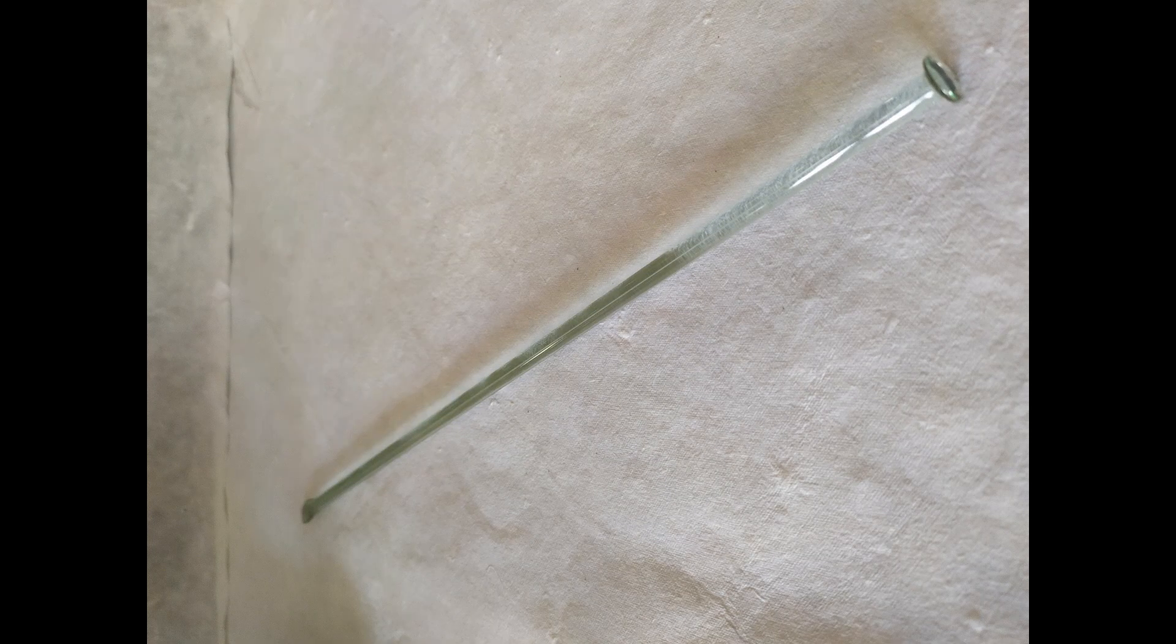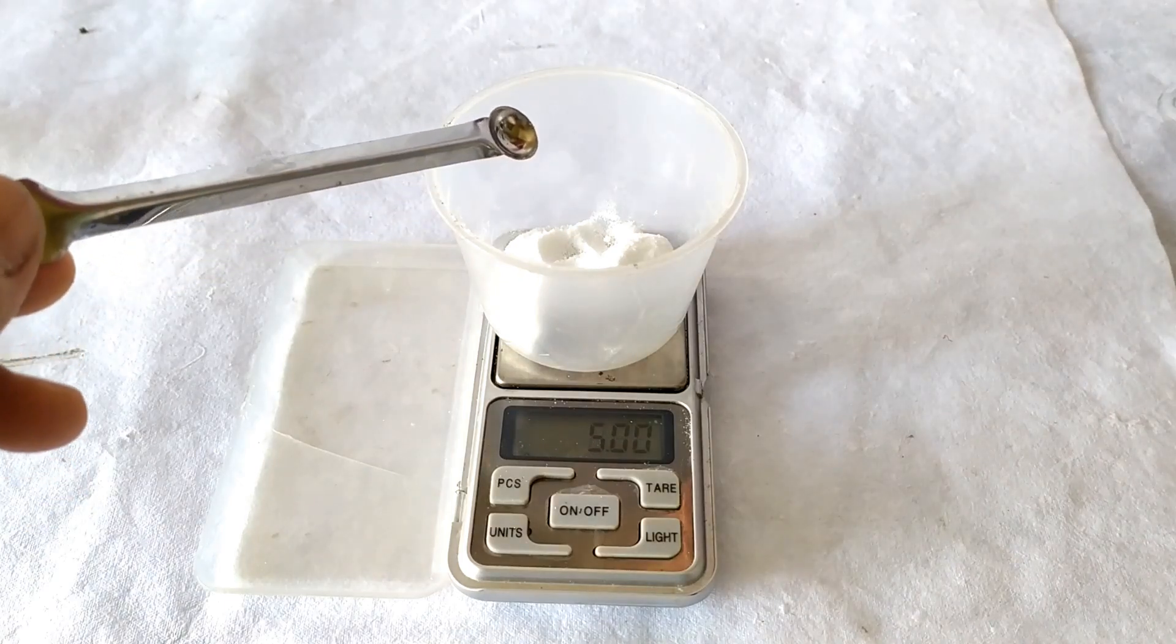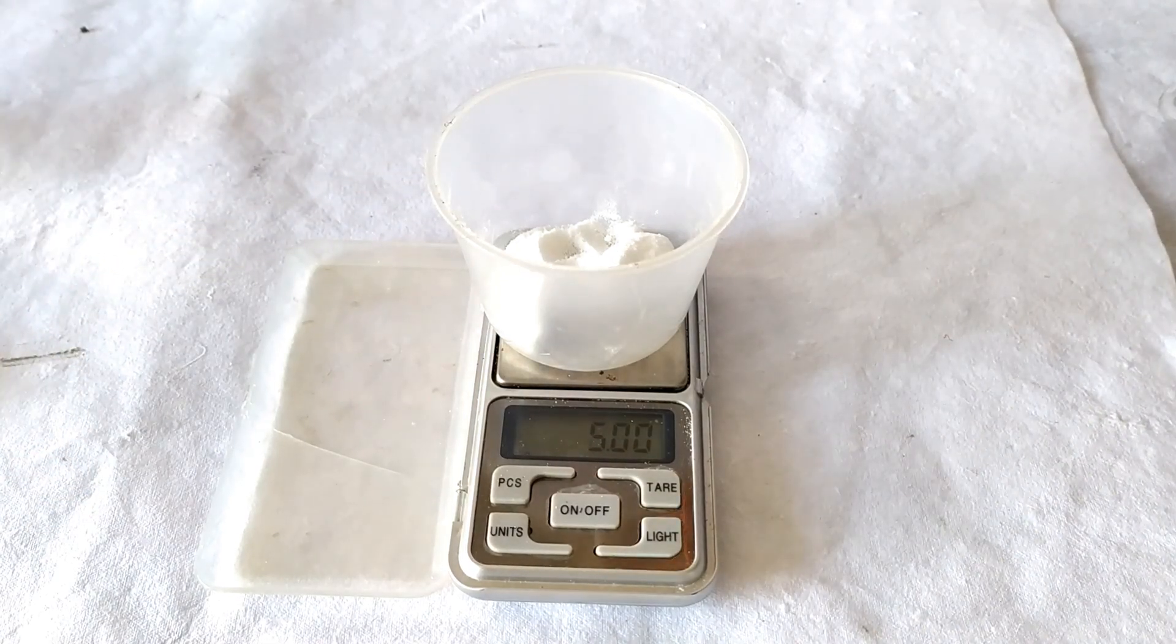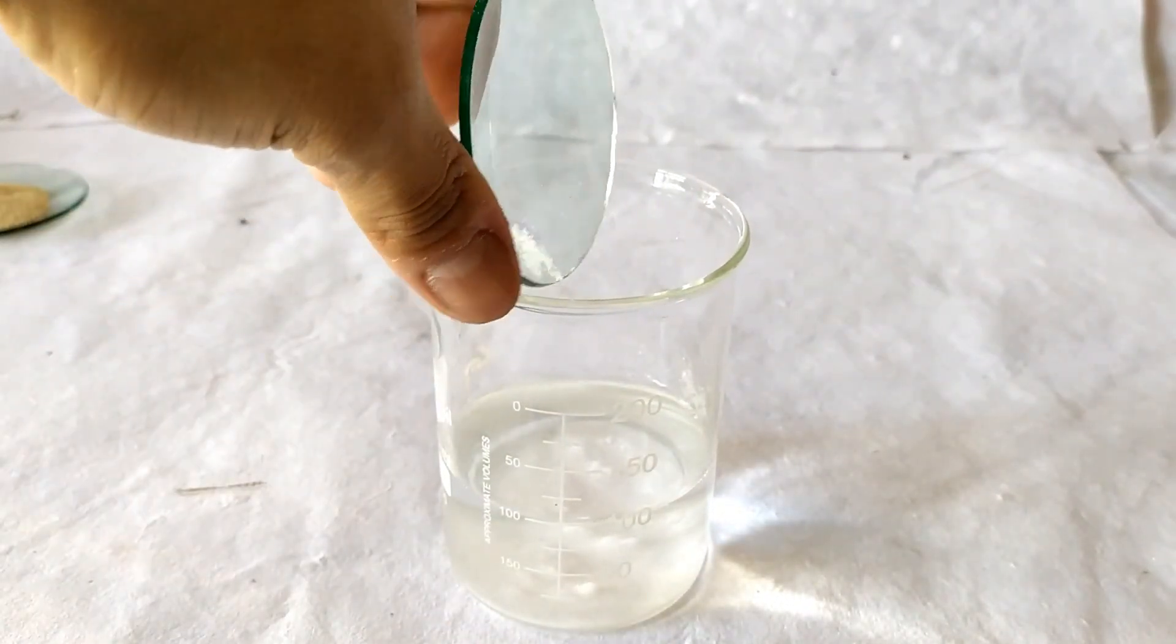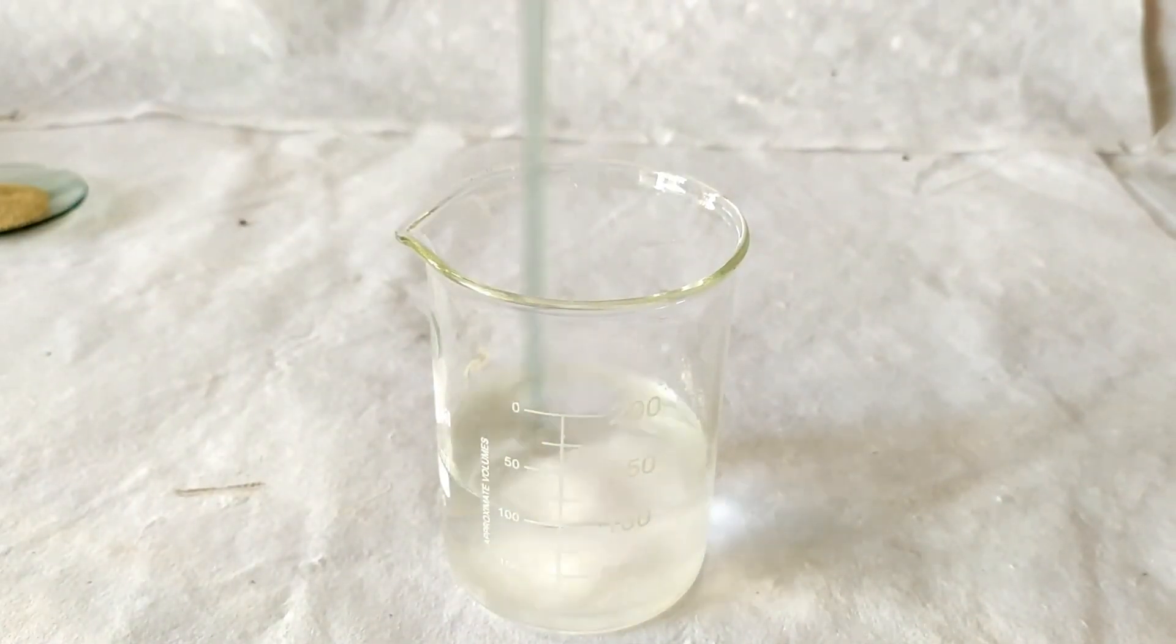To begin the experiment, prepare 5% glucose solution by dissolving 5 grams of glucose powder in 100 ml of boiled and cooled water in a beaker.